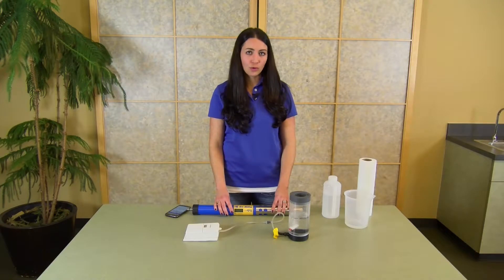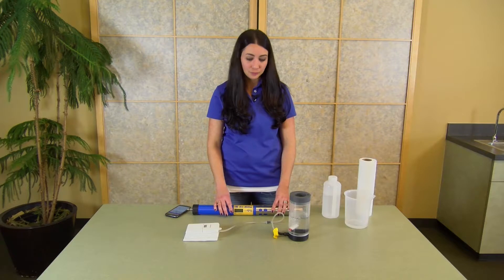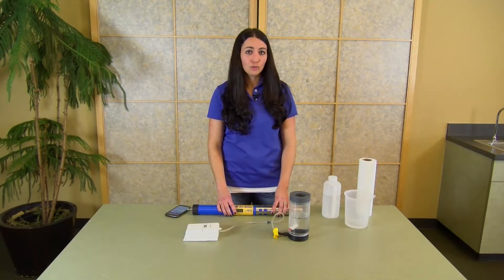The instrument allows for a one or two point calibration on the RDO sensor. Your one point is typically done in a 100% saturated environment, and your zero point in sodium sulfite or bubbled nitrogen. For your 100% saturation calibration point, there are two different methods that you can use: air-saturated water or water-saturated air.